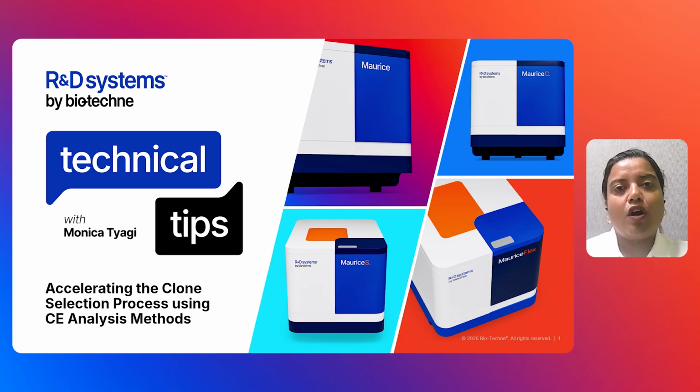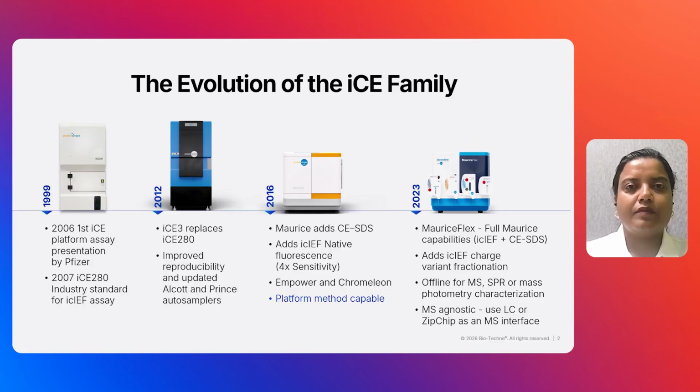Today, I'm excited to talk about the upstream process and how we can accelerate the clone selection process using CE analysis on our Maurice platform.